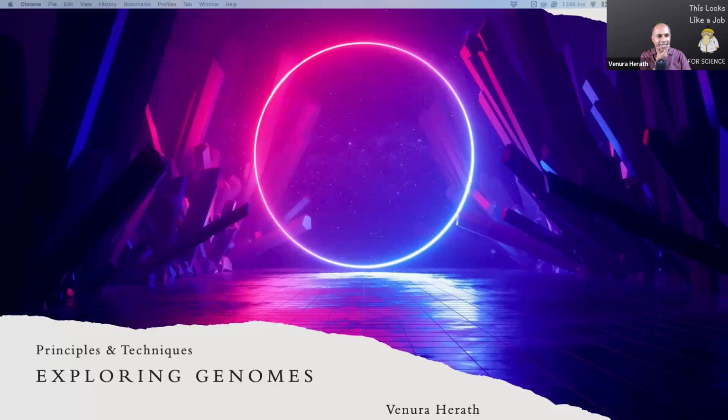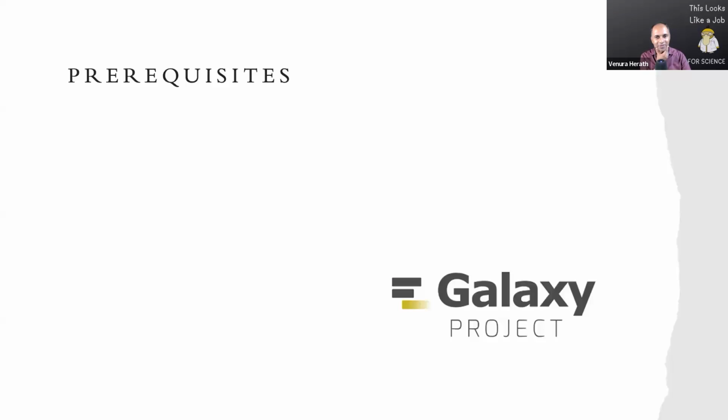Anyway, we will start and move forward with the activity. If you remember, the prerequisites are very similar to last time.